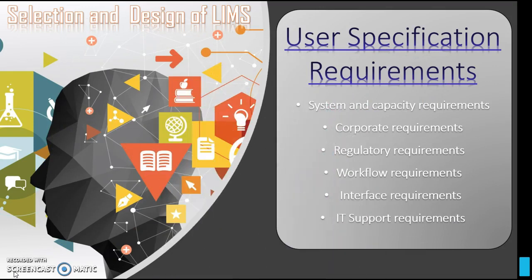It is essential that information systems within the laboratories be flexible and adjust to specific job functions, as well as be proficient in ongoing changes within the production systems. A large company can make many products and can have many different laboratories with a specific purpose, all while using the same LIMS. Today, most LIMS companies offer a client-server architecture that varies in their choice of operating systems and databases. These choices are of fundamental importance in choosing a LIMS as they dictate response times, user interface, and communication capabilities.